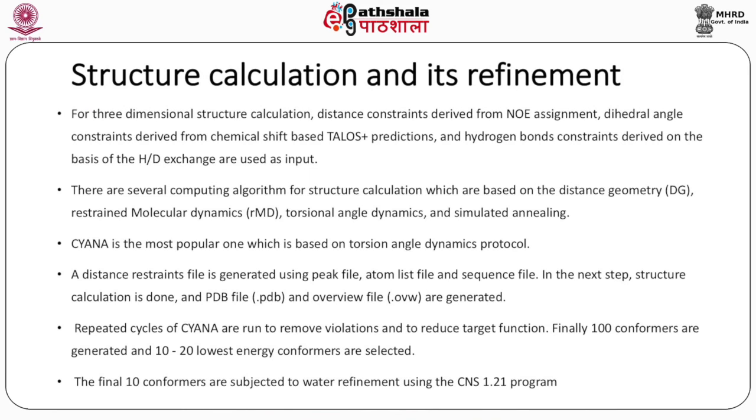Structure calculation and its refinement. For three-dimensional structure calculation, distance constraints derived from NOE assignment, dihedral angle constraints derived from chemical shift based TALOS+ predictions, and hydrogen bond constraints derived on the basis of HD exchange are used as input.